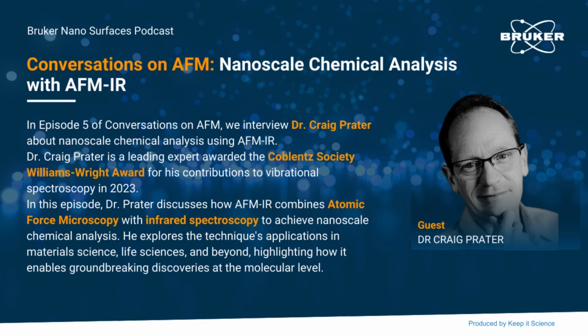And you also mentioned very briefly before that combining AFMIR and OPTIR is a possibility, which could be called multimodal imaging, right? But we also love a few other technologies. So maybe you can speak a bit about what other methods could be combined with AFM or AFMIR? And do you think that's currently a hot topic, or is it just that we as image analysts love to talk about it a little bit too much?